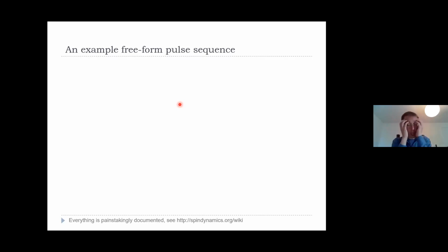I mean, oh goodness, that assembly language is killing me. But Varian, may it rest in peace, had actually a pretty sensible pulse programming language. It was a dialect of C. And what you'll see here is a dialect of MATLAB. Substantially, this is MATLAB programming, but with a lot of functionality that's already been implemented.